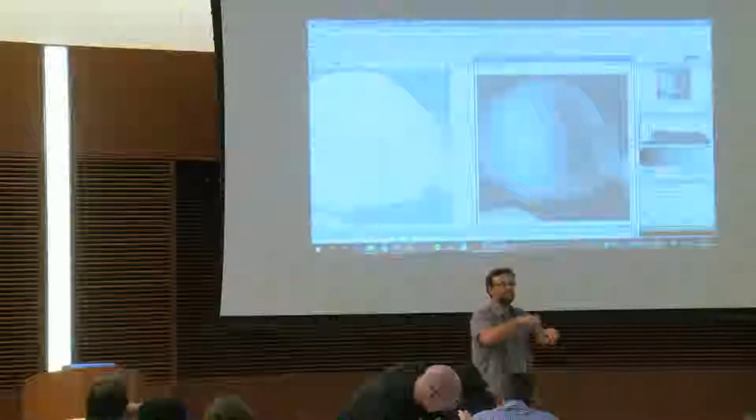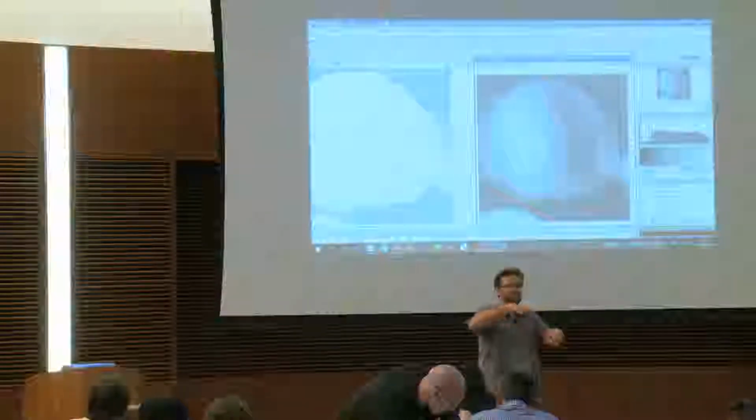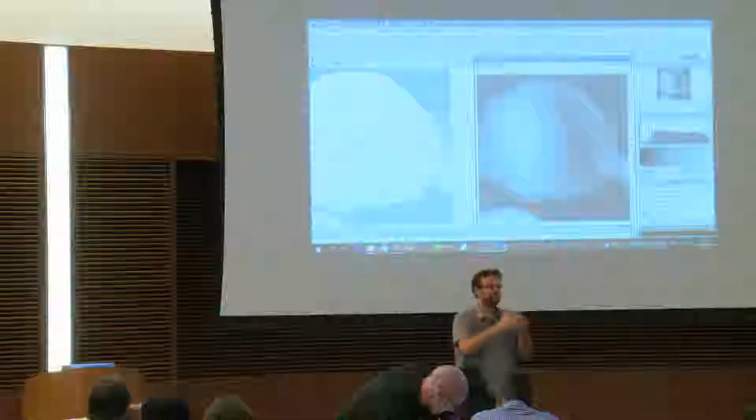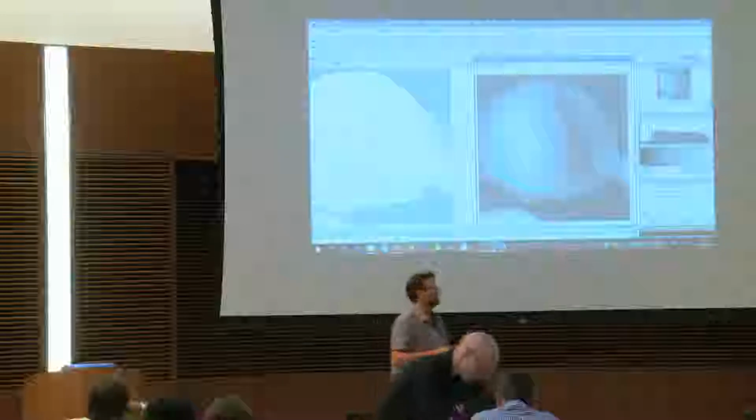Okay, so here it's physical, to understand why this device is not going to go to the same Z because of the mechanics. For the camera, it's the same, but it's going to be through the electronics, it can be through the tissue, well, this noise exists.